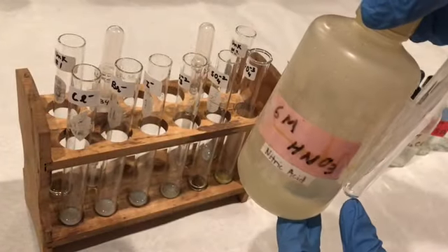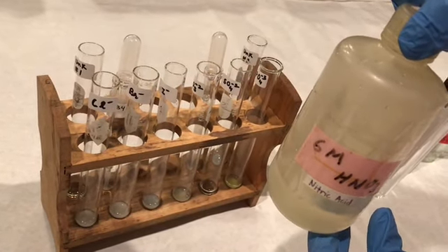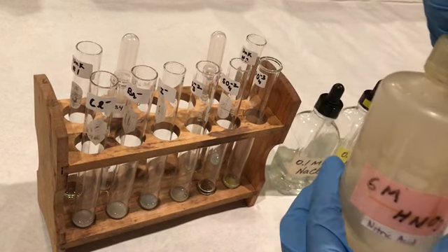Okay, now I'm going to do the second part of the silver nitrate test. After adding the silver nitrate, I'm going to add 6 molar nitric acid to all the test tubes.